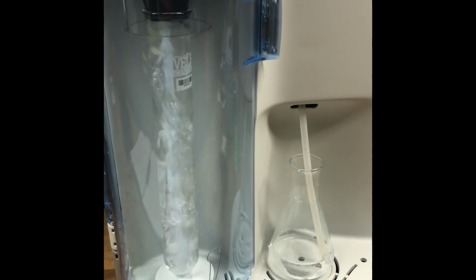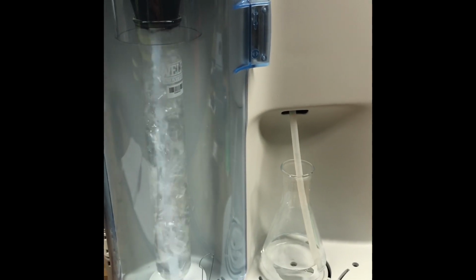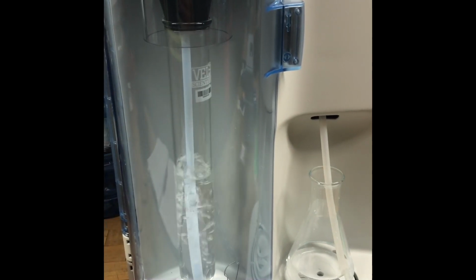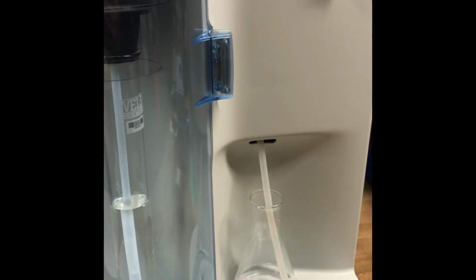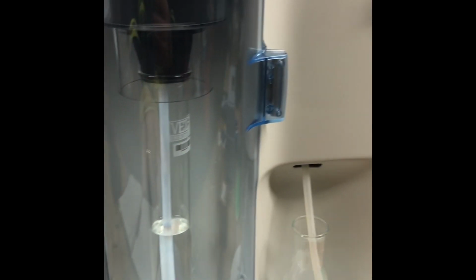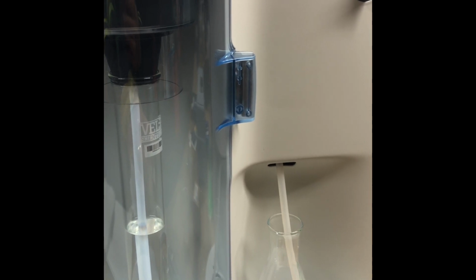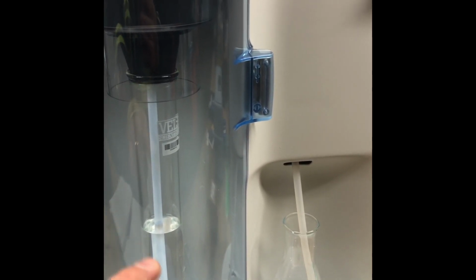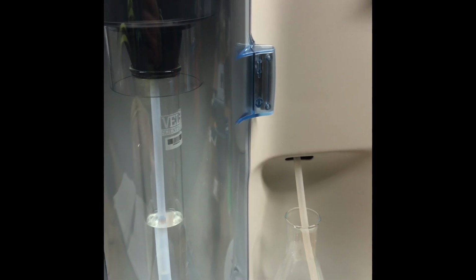So what should have happened here is all of the free unionized ammonia, basically dissolved ammonia gas, should have transferred over with the steam generated over the 5-minute period, so transferred from this vessel over into that one. Whereas the heavier, larger molecules of amines and amides would have remained with the original sample over here.